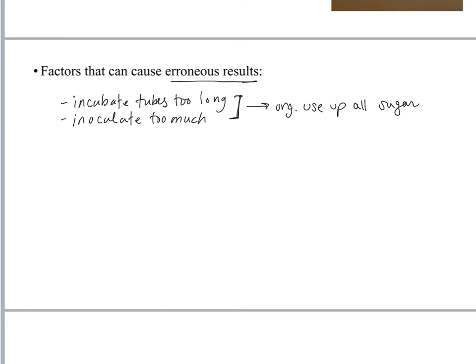Okay, and what happens when that sugar nutrition source runs out? Well, it could be that the organism would die, but that's not likely to happen because remember I said most organisms are a little more flexible, and they can use other macromolecules for energy. So typically, the other macromolecule that's there and available to use for energy is proteins. Okay, so we have a phenomenon, we call this process alkaline reversion.